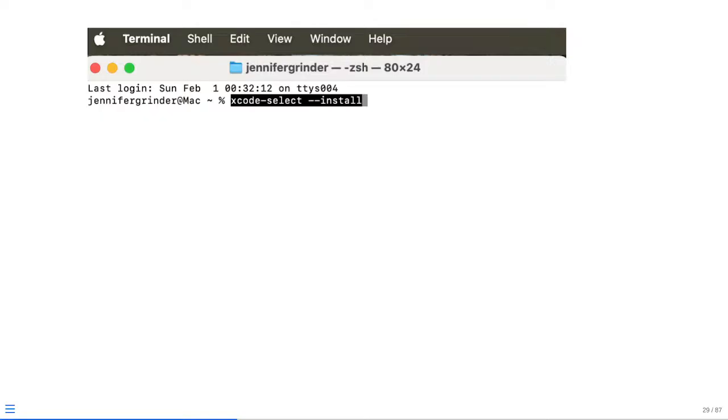This is a screenshot provided by Jennifer. I appreciate her help getting these screenshots because I had already done this process on my macOS, so I wasn't able to do it for the course. I appreciate all the effort that went in.